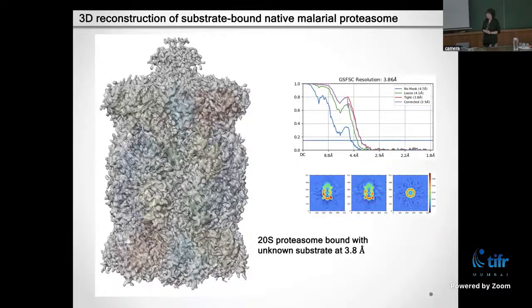Yes, we were able to. So once we identified that this may be one of the particles, then what we can do is we can use a picking process. And there are different kinds of picking programs, and many of them are guided by AI. In different orientations, this is what the particle looks like. So along with noise, can we look through the data set to enrich the data set for only these particles? So we can separate out these things in 2D.